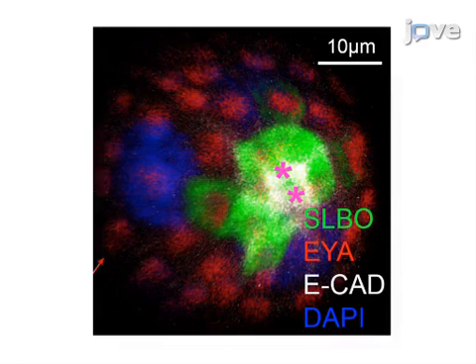Ultimately, confocal microscopy is used to reveal cellular and subcellular organization at the poles of the egg chamber epithelium, such as border cell arrangements.